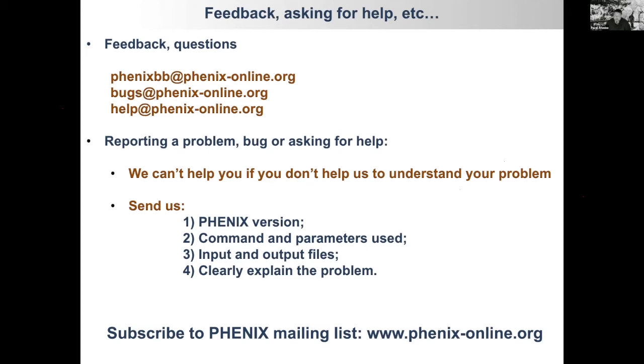So if you reach out to us with your problem or question and you expect us to help you, these are the steps that you need to follow. And that will pretty much guarantee we can do something for you.